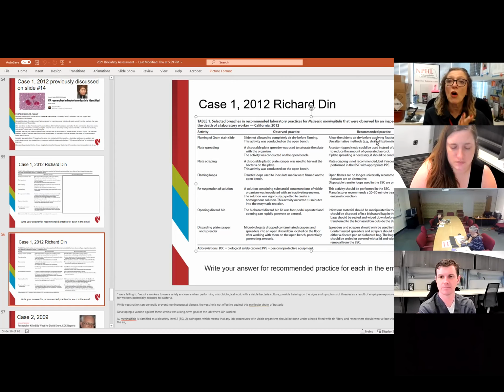And you should do this with all your specimens that you do in any microbiology, not just these hazardous organisms, all sputums, all blood specimens that you're doing on your blood bottles should be air dried first and then brought out.